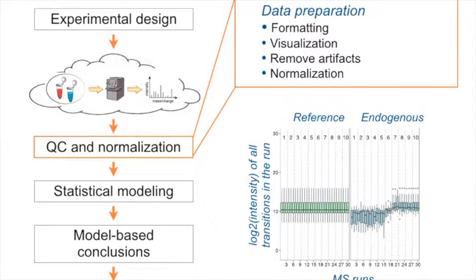So if we spike in equal concentration, can we still go ahead and use the quantile normalization? Yes, but it depends how many IRT peptides you have and how many features per IRT peptide you have. But you can do quantile normalization with 3 features if you want, right? So you will look at the median and the maximum and the minimum. But it is true that quantile normalization works best if you have a little bit more features. But indeed, if you have multiple features, you can do exactly that.